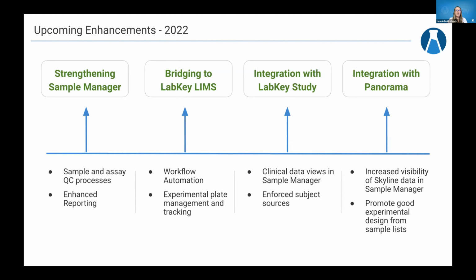Also including enhancing some of our features, such as adding quality control processes to sample and assay data, as well as continuing to improve on that reporting to give the greatest value for people working in the lab. Bridging Sample Manager to a LabKey LIMS, and so really starting to build on our task-based workflow and provide more automation around that, again gaining efficiency for teams in the lab, and being able to track experimental plates and manage those within the system as well.